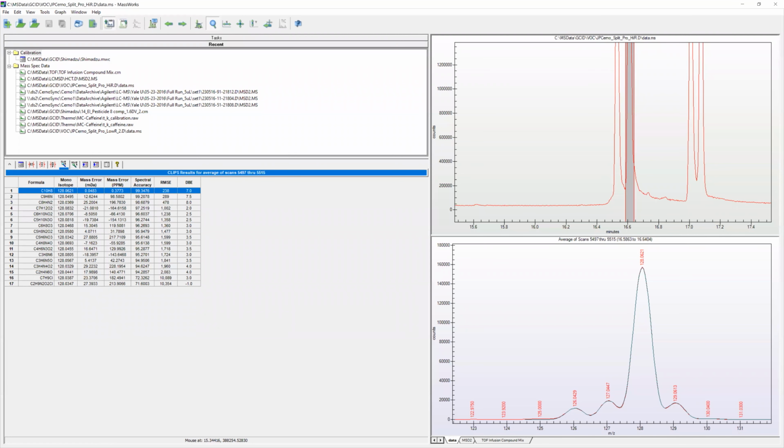Now, if you don't have chromatographic separation and the isomers by definition have exactly the same elemental composition, their molecular ion in the case of an EI spectrum would be identical. So from a mass spectrometry perspective, you cannot differentiate them. They'll come up as a single compound with the same elemental composition. You might not even notice you have additional isomers co-mixed in if they're not chromatographically separated.